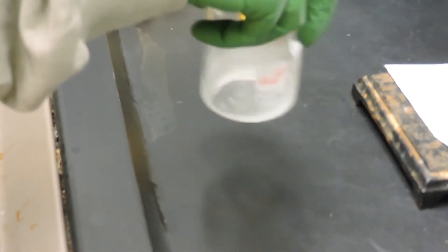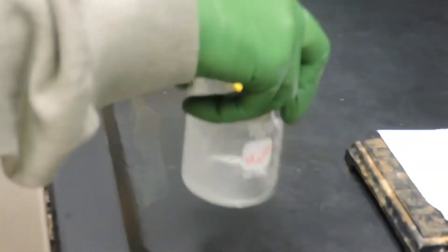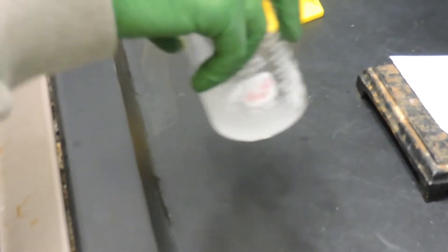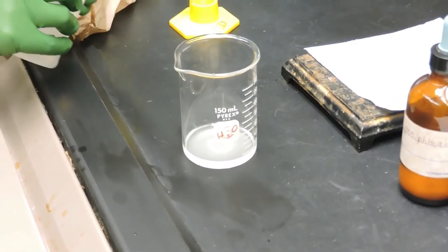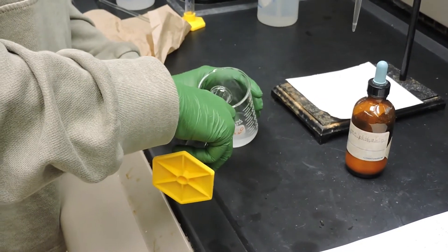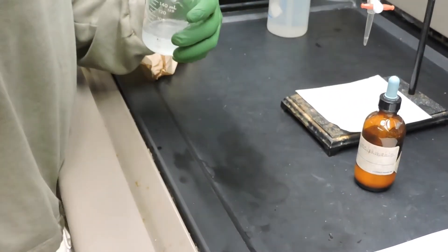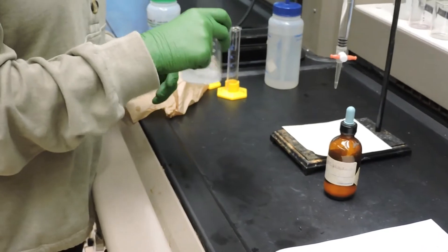Now we can stir this well. It should dissolve the majority of the aspirin. Any residual particulates are most likely binders used to hold the pill together. Now we'll add 25 milliliters of deionized water, followed by two drops of the phenolphthalein indicator.